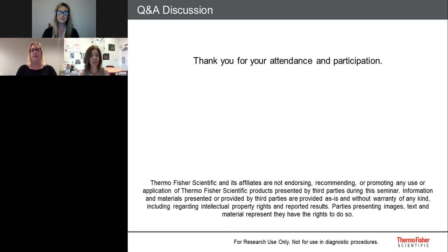That's because the focus of the exome is on the coding sequences, coding exons. And with the XON array, I've seen that the non-coding exons are also included in the coverage, and that makes a big difference, especially for exon 1, which is often not very well covered. So that's the big difference: coding only or coding and non-coding exons.